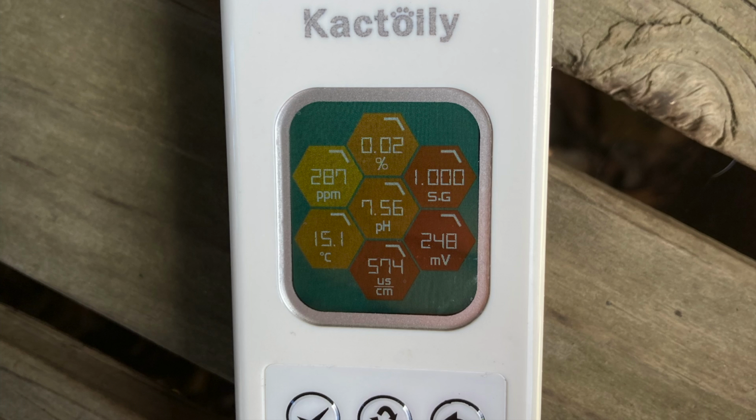The reading on this surprised me a bit. I expected the TDS to be as high or higher than the other pond that was under the roof line. I've also noticed that the TDS readings seem to be lower on the ponds that I feed. I'm not sure if that indicates the quality of food isn't as good, or it's just the amount of fish, probably a bit of both.